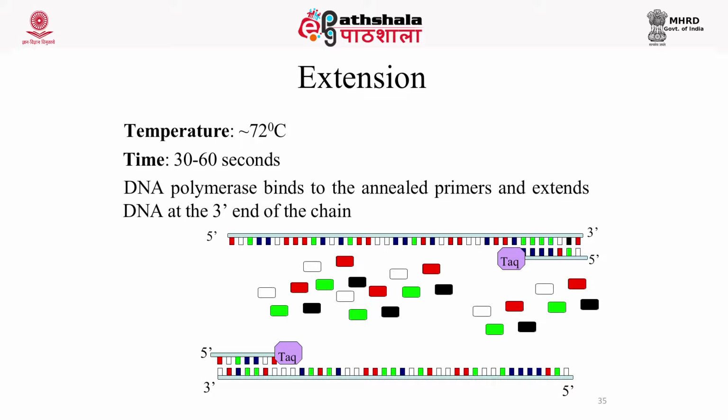It is required for 30 to 60 seconds. During this step, you can see in this figure that the purple box marked as Taq polymerase binds to the annealed primers and extends the DNA at the 3' end of the segment.